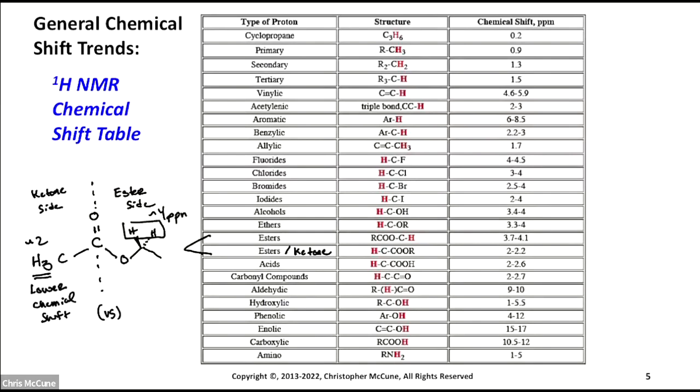So the alpha carbon, if there's hydrogens for a ketone, that's the range you would see, around 2, 2.1, 2.2. A little bit confusing otherwise, but really the table is great here because it has a wide range of different types of functionalities.